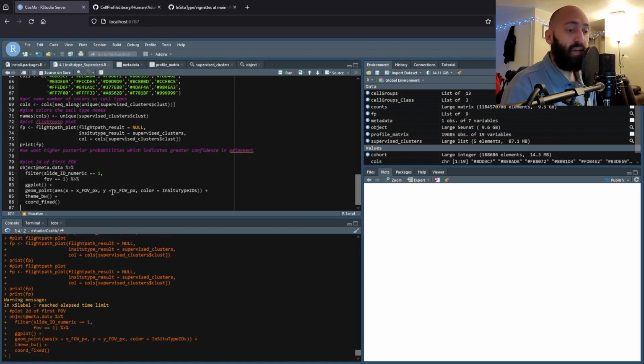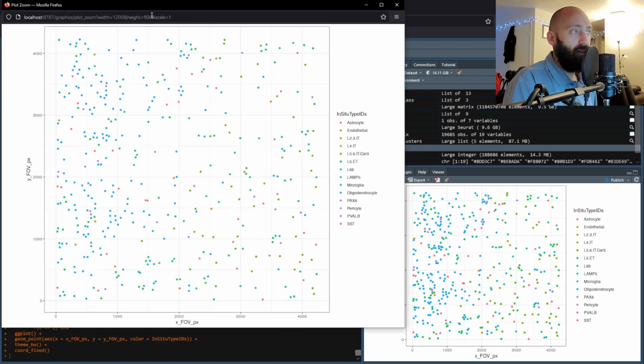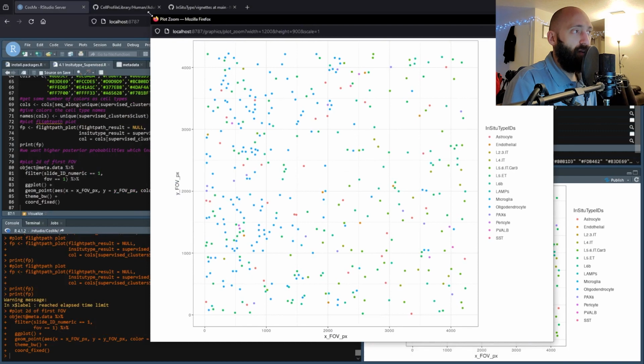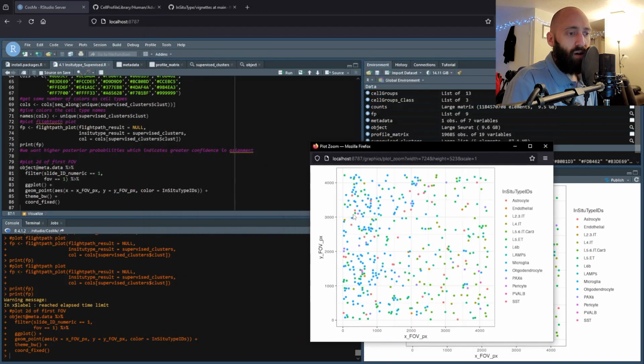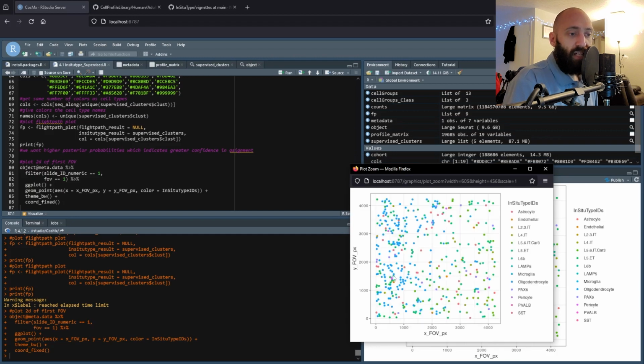And then we can plot just like we did when we were exploring our data. Let's see if I can shrink this down a little bit, get those points a little bit closer together with our new phenotypes. So we can see that there's this hotter region like we had originally seen of the blue cells up in this upper left-hand corner, and then it's more vacant of those blue cells here in the bottom right.